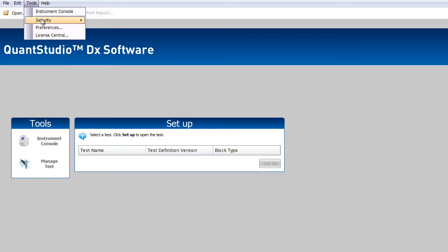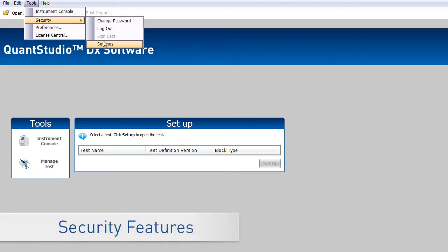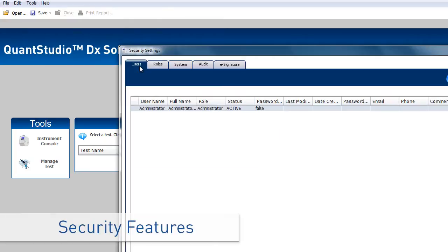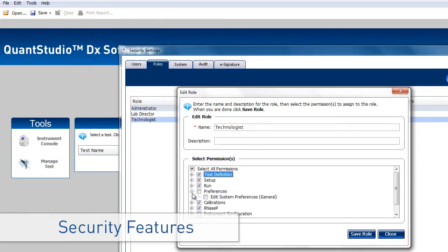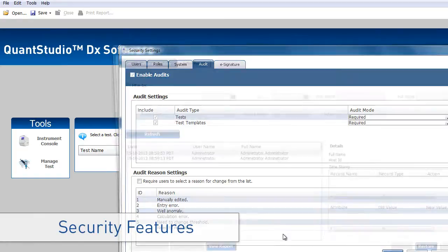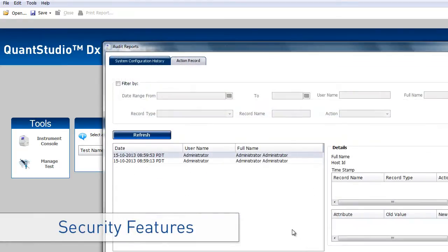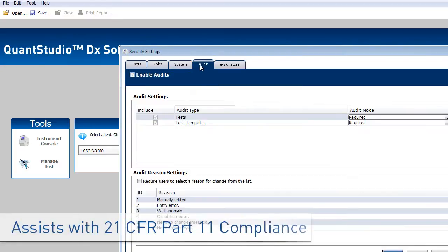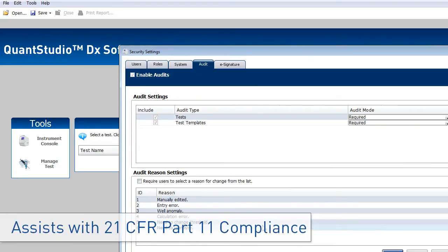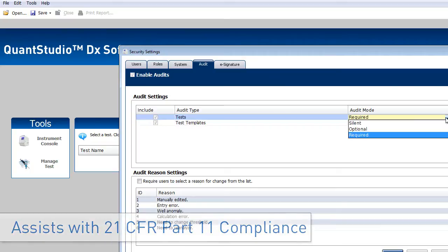The QuantStudio DX software enables you to maintain secure access to instruments, specify user access to various software functions, record all actions completed by users, and sign data electronically. In addition, the onboard software assists with compliance for 21 CFR Part 11 and runs IVD tests in a secure mode with set parameters for run and analysis.